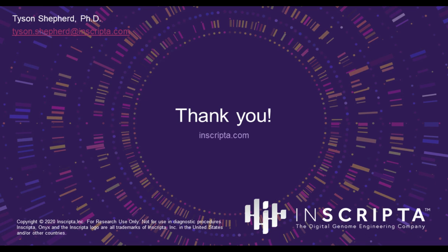Now, Dr. Tyson, our next question is, can you remind me how you made the IS mobile element insertion and how long of the edit can be made? Yeah, good question. So the length of the edit that can be inserted is up to 61 base pairs. And as I mentioned a minute ago, we have a promoter library that's the subject of a former presentation you can see by Dan Held, for example, who's talked about such an application. So insertion lengths can be up to 61.